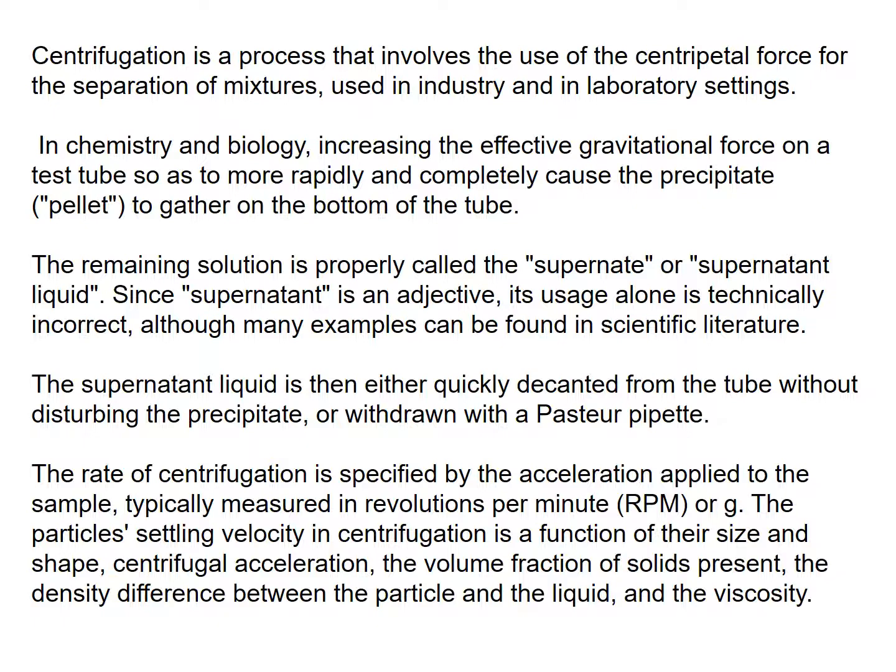This is some words here, hopefully discussing what I've done, and something we hadn't talked about. Revolutions per minute, or G-force, is the measure of the amount of centrifugal force applied. And again, size, shape, density, the amount of solids present, the density difference between what we're trying to separate and the solvent, the liquid it's in, and how viscous, how thick, the liquid is.